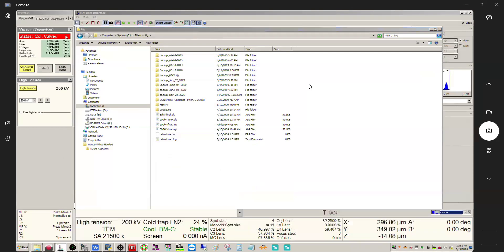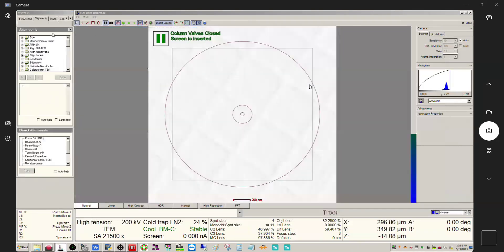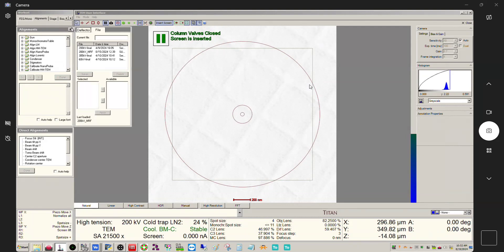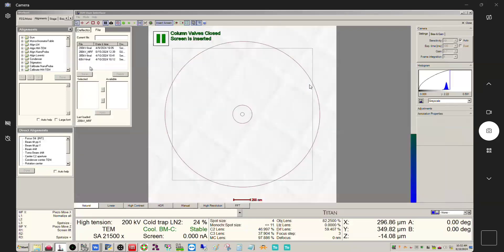You can find your alignments panel wherever you have it located. I have it inside of a tab labeled alignments of course. And then if you click the file tab here you're going to see a list of all of the alignment files that are in this alg folder.